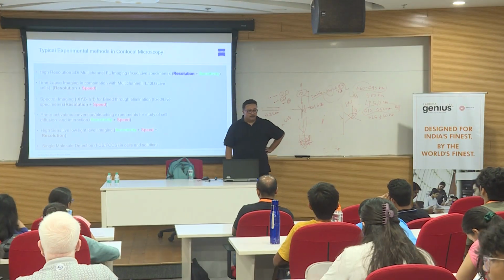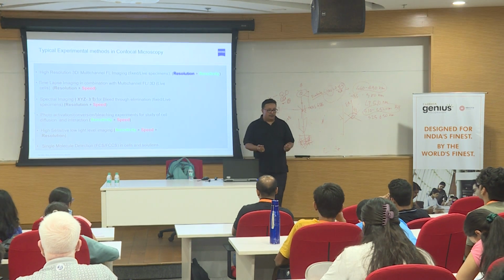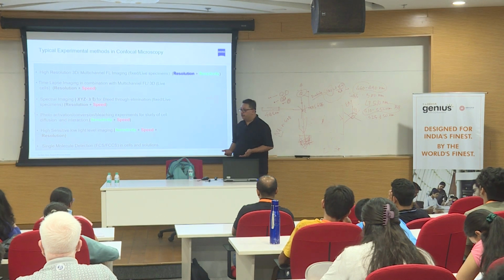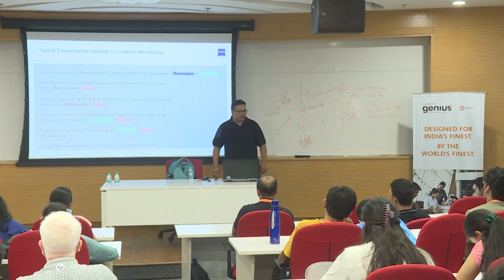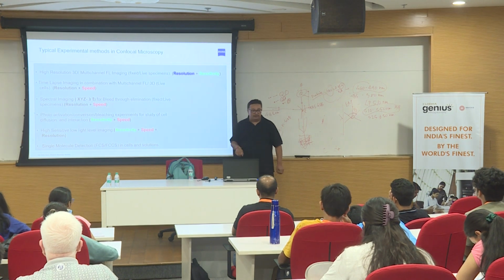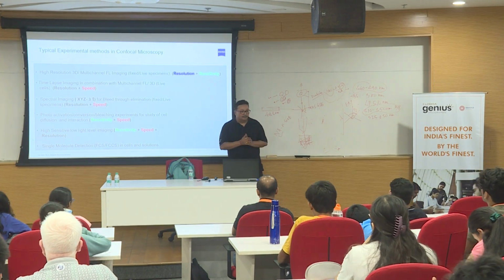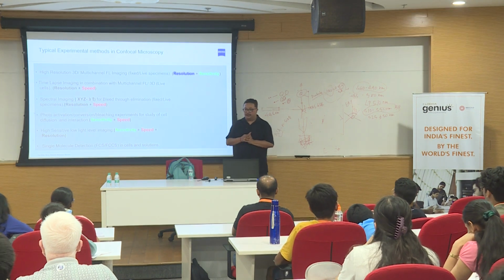Good. So here when we talk about confocal, we talk about low light level signal, we talk about fluorophore imaging, and whenever we talk about fluorescence imaging, we talk about a dark background. We talk about the dark room image because I don't want to capture the stray light. So sensitivity means the capability of the system to acquire low light level signals, because what matters at the end of the day is a good image.